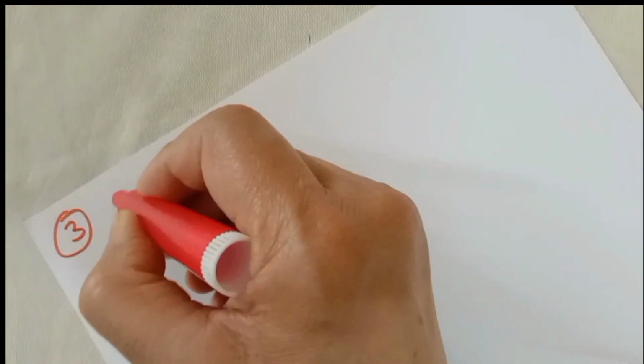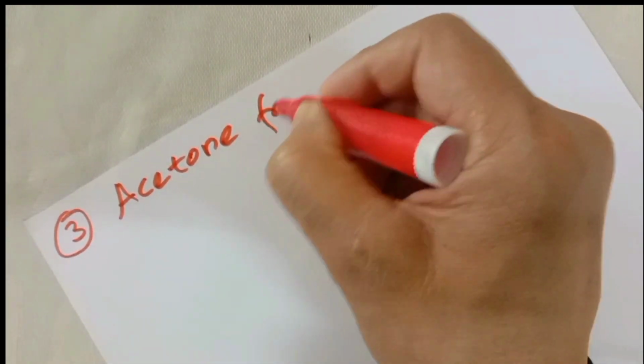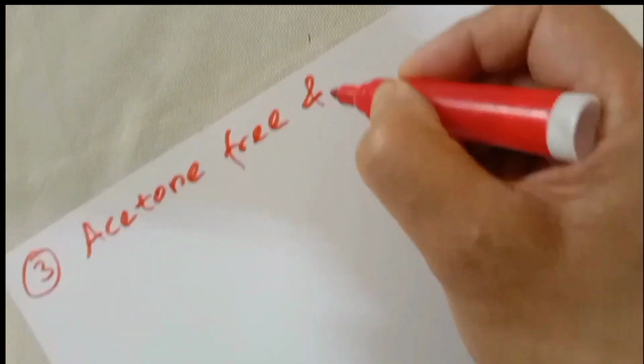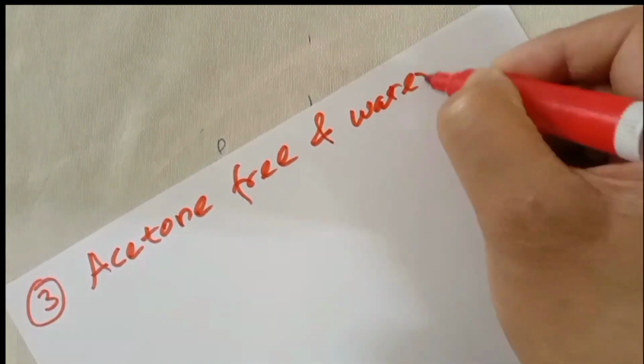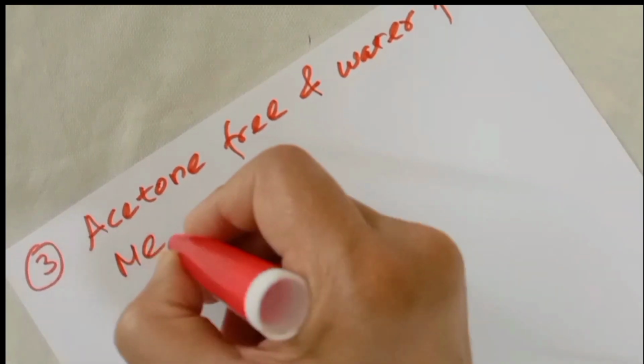And the third component is the acetone free and water free methyl alcohol.